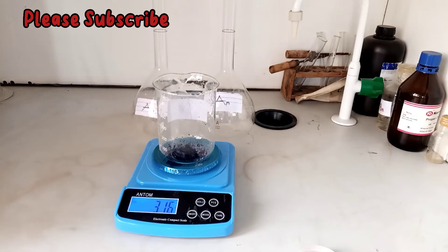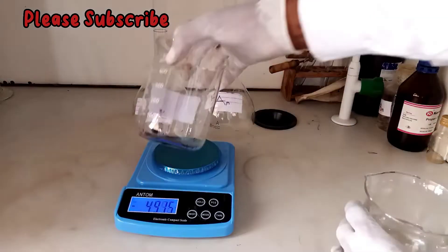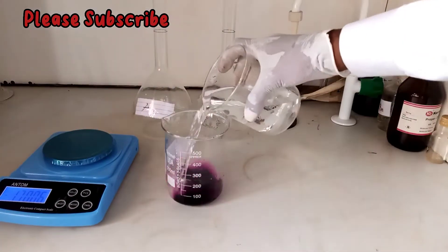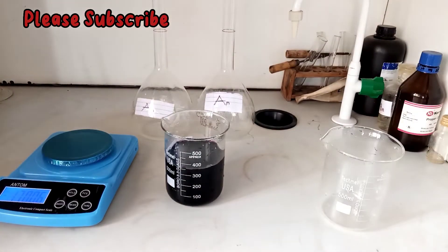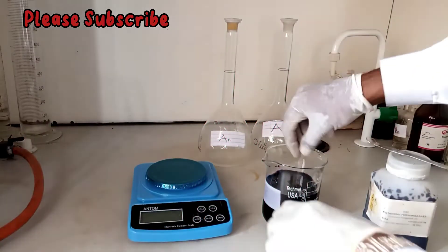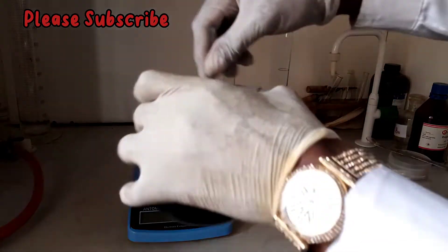Then after that you add water to it. You stir very well and ensure it dissolves properly in it.